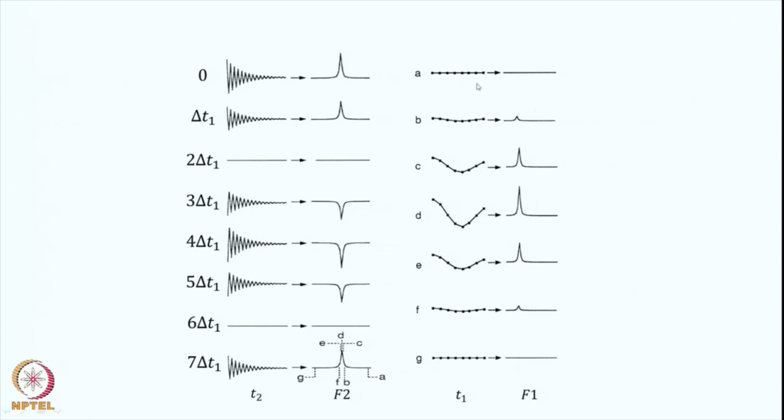Therefore, I can do a Fourier transformation along this time axis now, right. This is the time variable T1. So, if I do a Fourier transformation along this time T1, there is no signal here, therefore there is a 0. If I do it here, there is a small signal, a small frequency component here, therefore you have a small signal with a particular intensity which is very small. Now, if you come down further, it is the same line, it peaks at this point, now the intensity is more. So, intensity is higher, so this FID signal is increasing, the signal is higher here, Fourier transformation again decreases, goes to 0. Therefore, you see here I have created a time variable which contains frequency information.